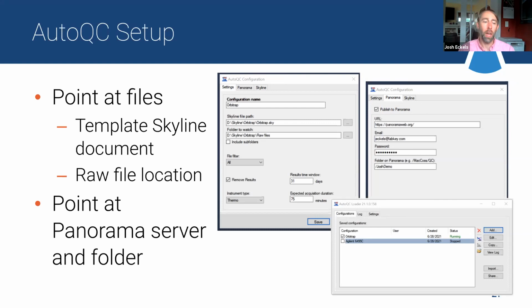You can say, hey, I'm working on this data set, Lindsay, I want to give you access to it, but not everyone in the world. So you've got a lot of fine-grained permission controls, and whatever you're comfortable with, and whatever makes sense for that particular project. Can definitely relate.